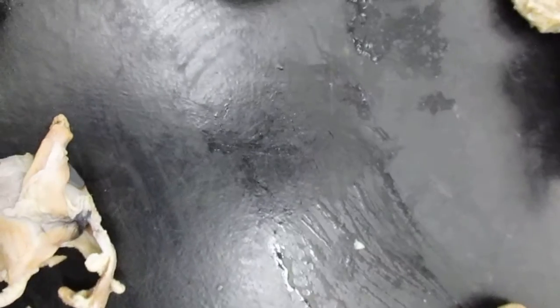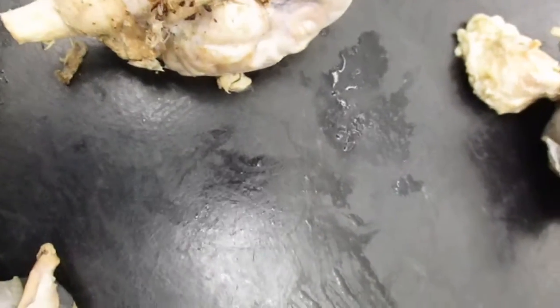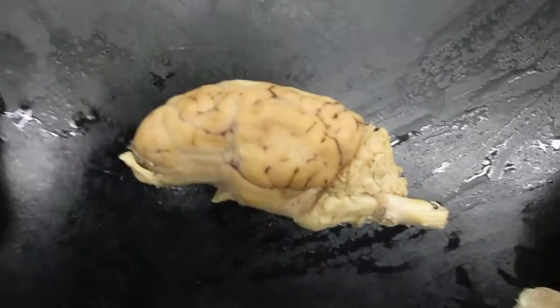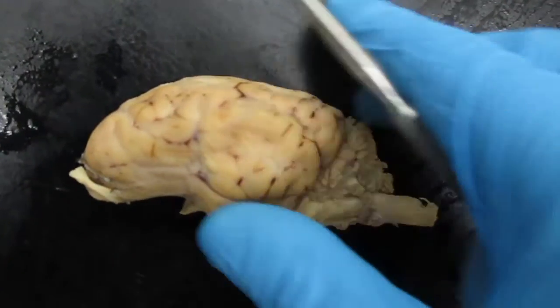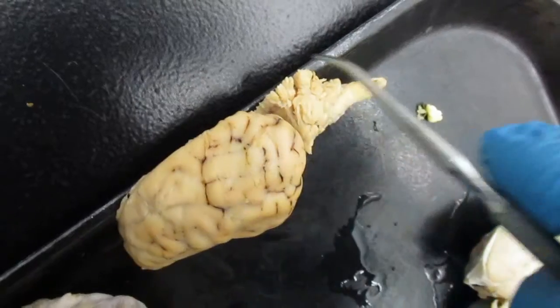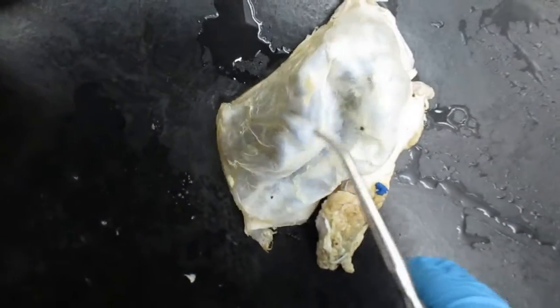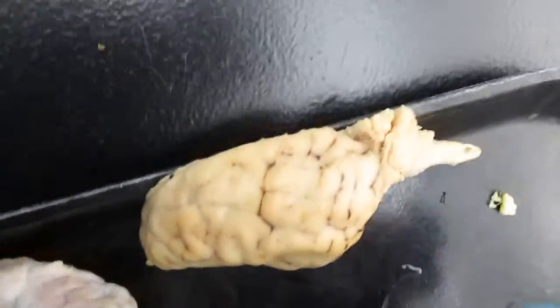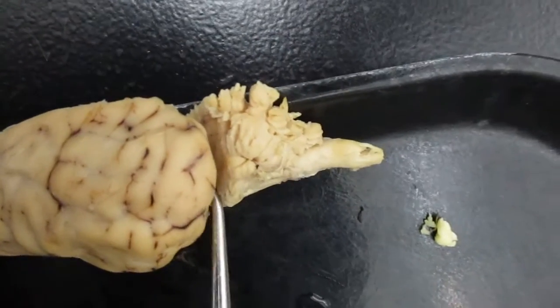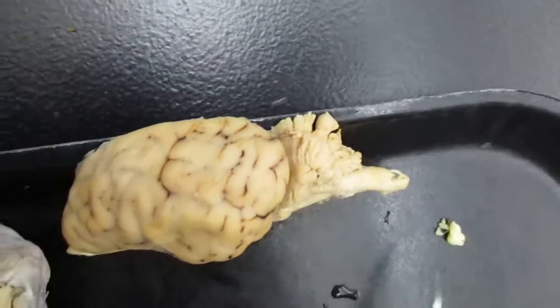Okay? So, I want to next talk about the sheep brain, or the hemisphere here. Again, right here, you can see the longitudinal fissure, which I've cut. I've removed the dura mater right here. So here's the dura mater, it's been removed. Here's the longitudinal fissure. And here is the transverse fissure right here.